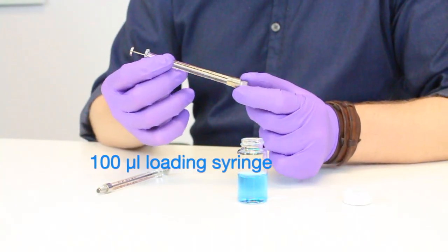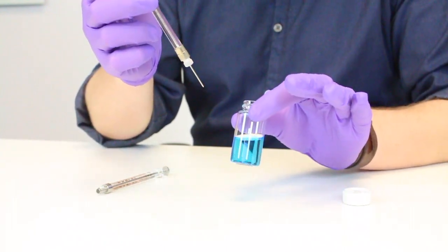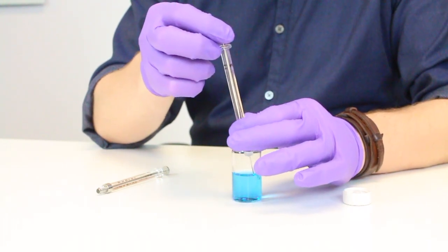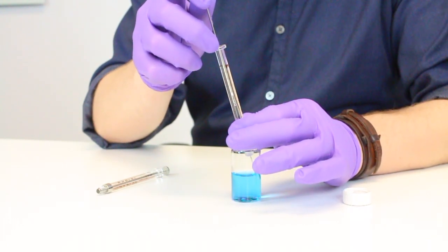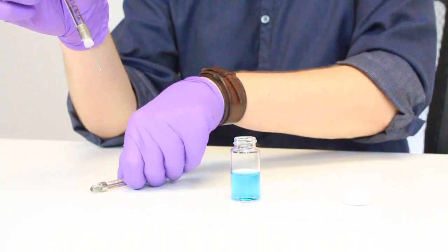So here I have a 100 microliter loading syringe and I have quite a bit of sample here but this even works if I have a tiny amount of sample. So I'm only going to draw up a little bit. Let's say I'm working with 50 microliters. So there I've drawn up 50 microliters.